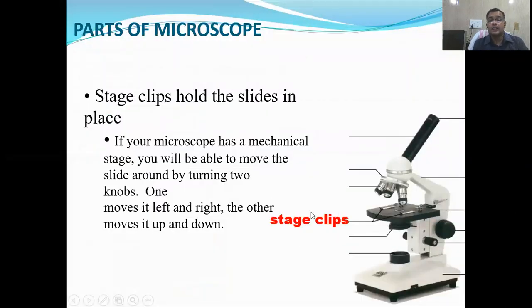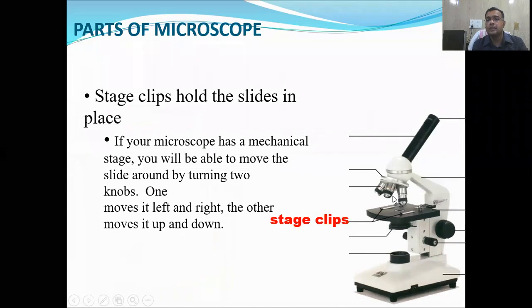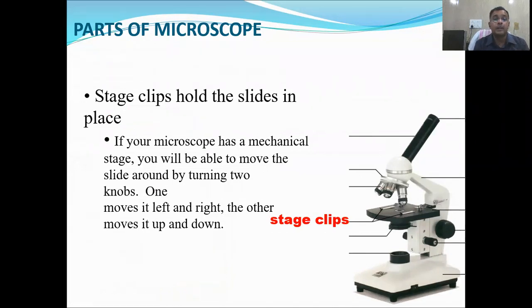The next is the stage clip. Earlier I had already mentioned that stage clips are present on the stage, and they help to hold the slide so that it does not fall while observing the slide.